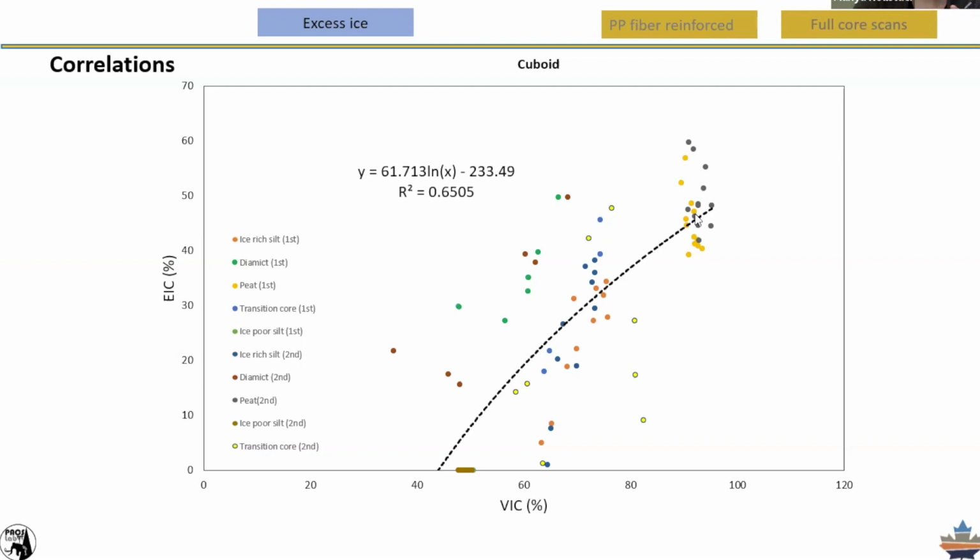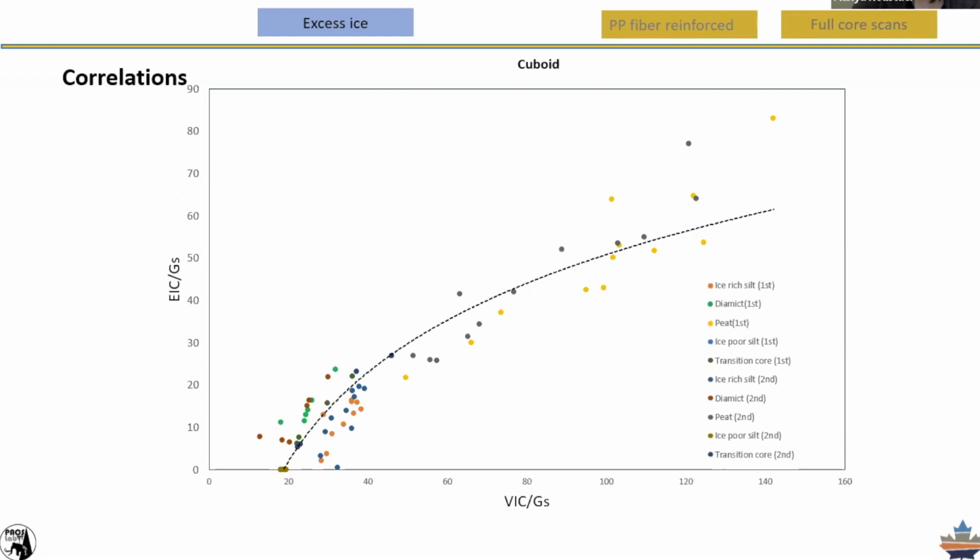These have very high gravimetric moisture content, maybe around 1,000. And yes, in some ROIs, we had 80% ice and just 20% material. Yeah, I could see you were getting better correlation when you were dividing these numbers, normalizing them.